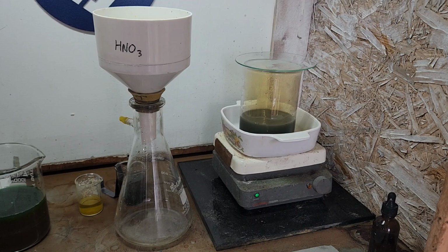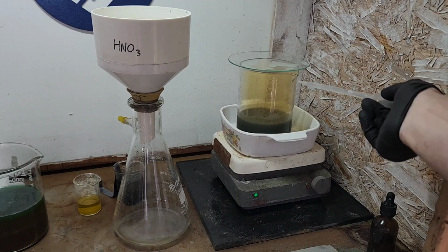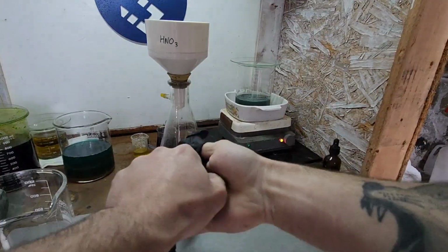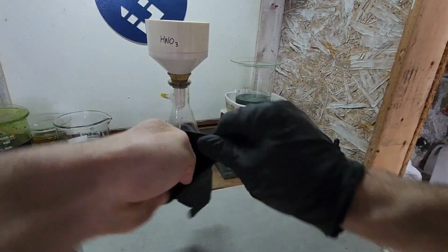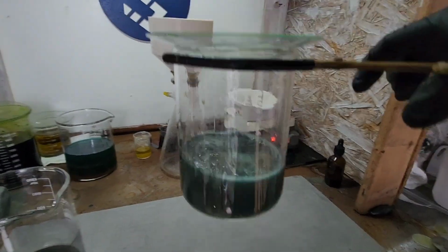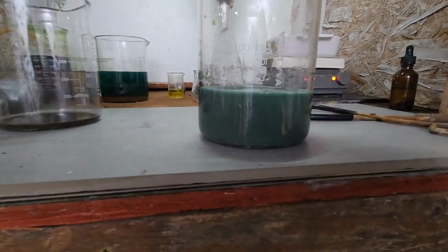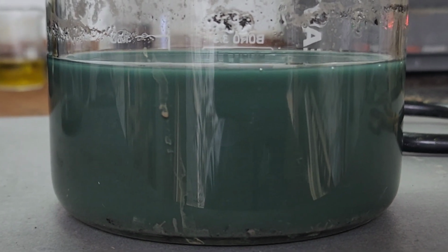All right, we're going to go ahead and add a little bit of nitric now that has kind of died down a little bit. All right, let's check this out here. Hold on, let me get gloved up. So it looks like it's a different shade. It looks like it's a little nicer shade, I should say, instead of that brown. So I'm curious if we absorb that. I would say we did. Well, that's cool. Yeah, check that out. Maybe a little bit in there. It also could be just fine. We'll definitely know when it settles more.